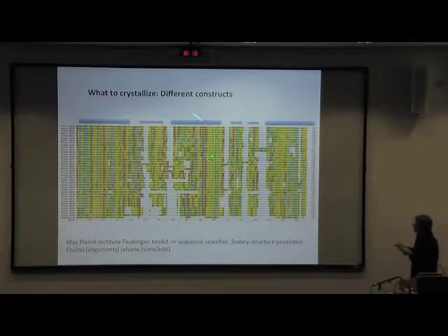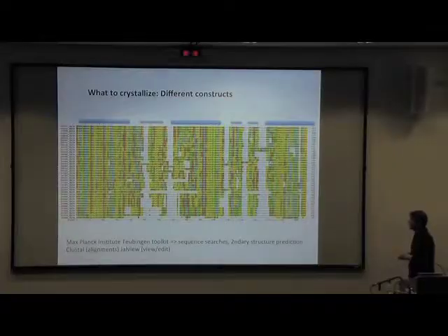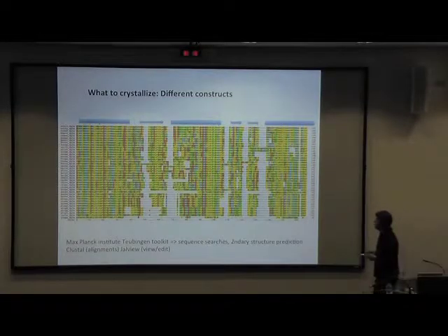But if you use the information from a secondary structure prediction program, you can say, well, I know that the prediction is from residue 12 to 22, so that's what I'm going to build. And I myself have been amazed at how accurate these predictions can be, maybe off by 1 or 2 residues. There are many different websites you can use for that.